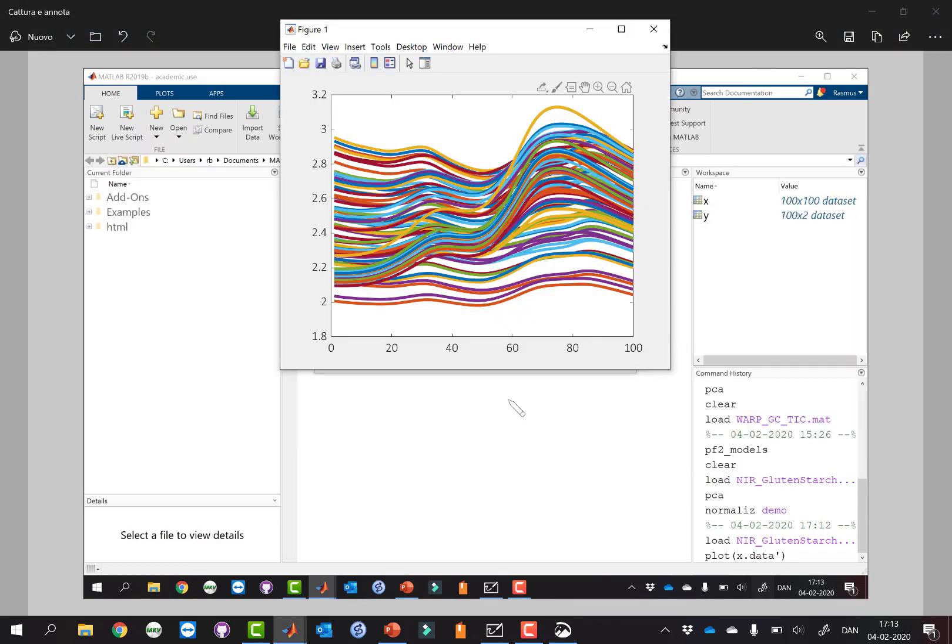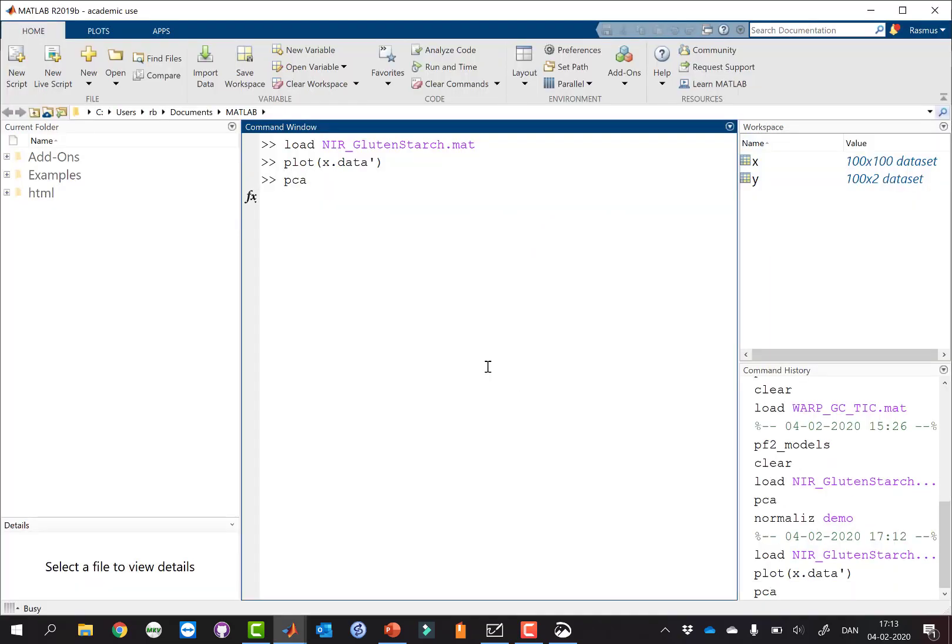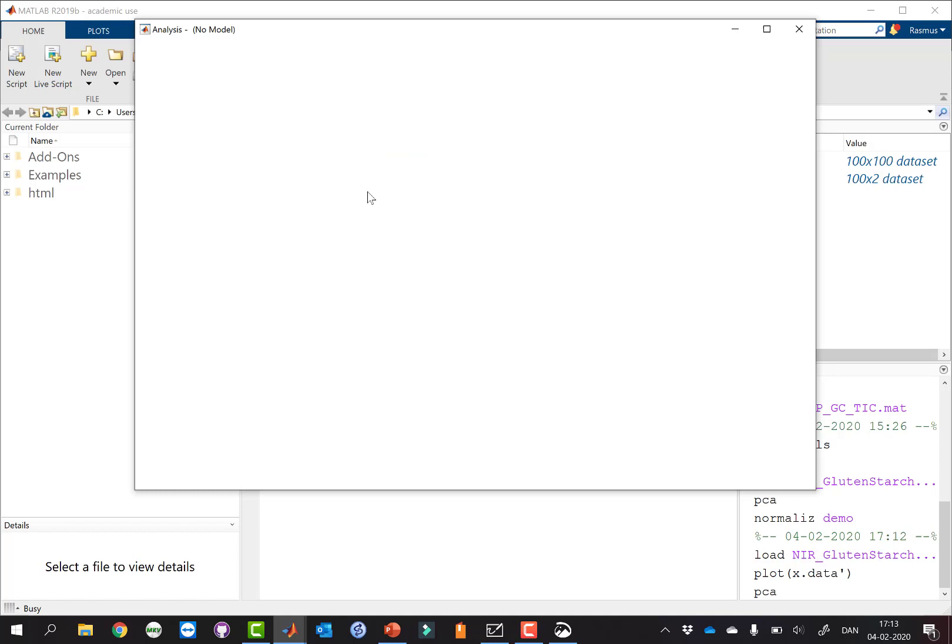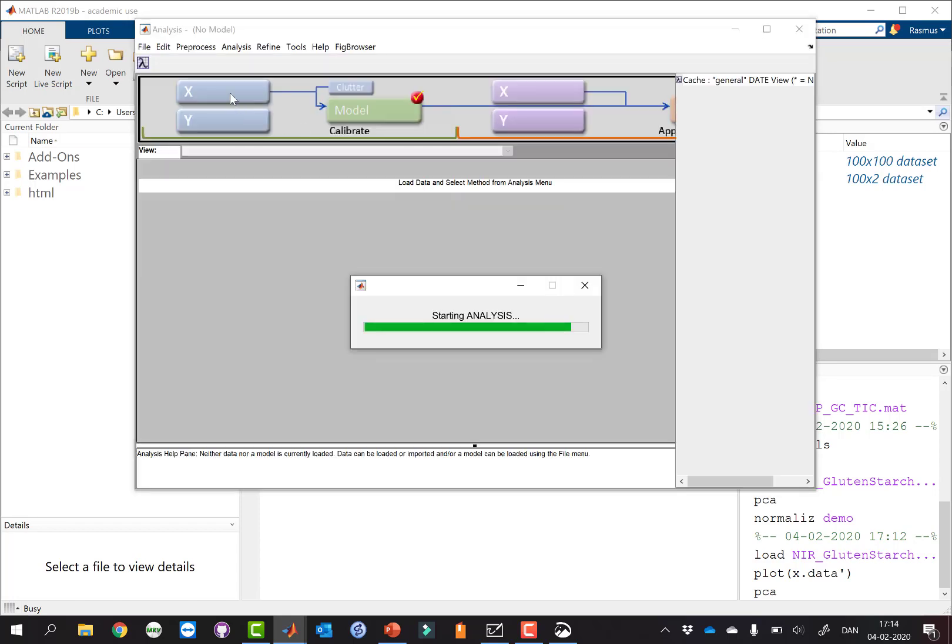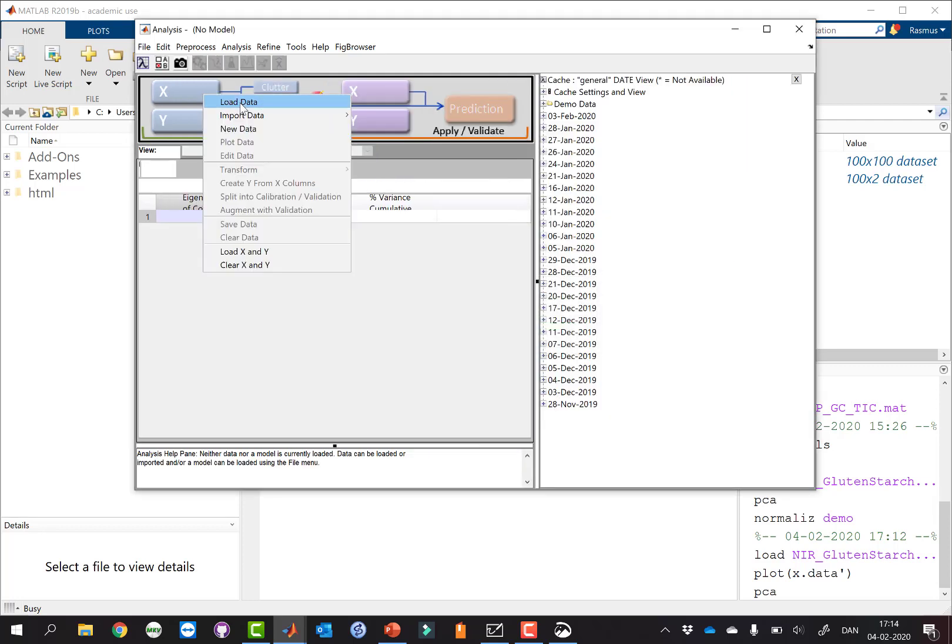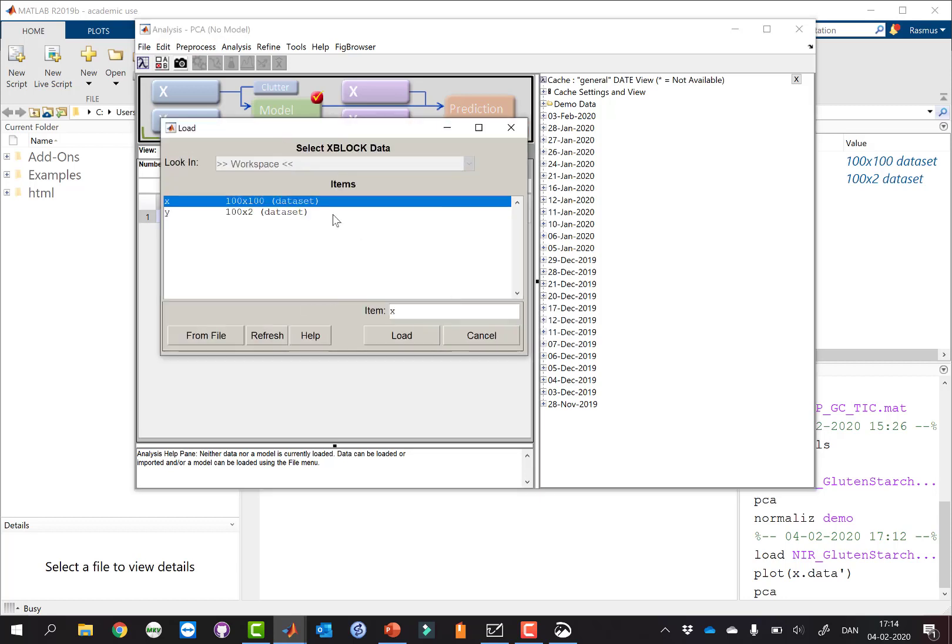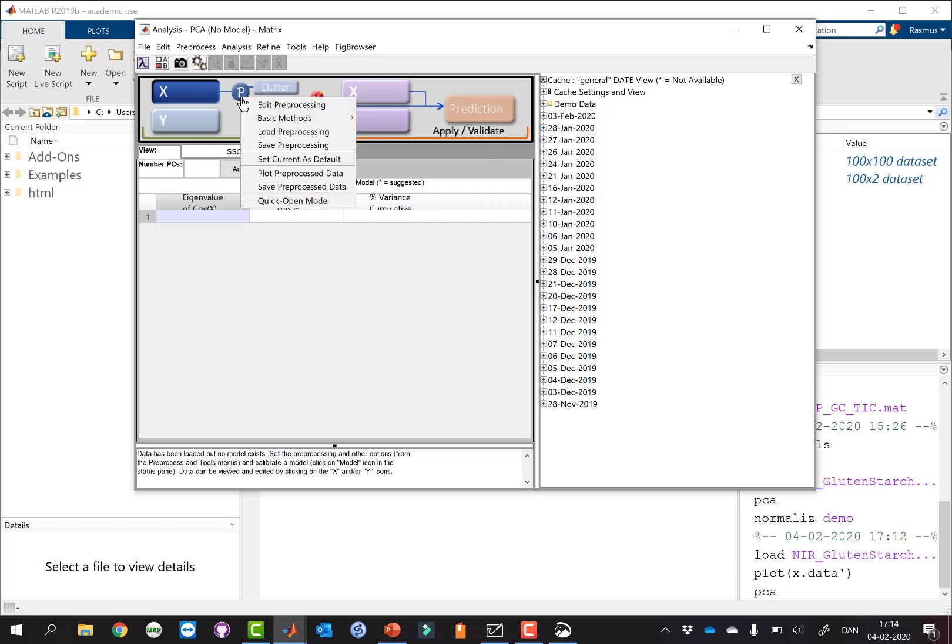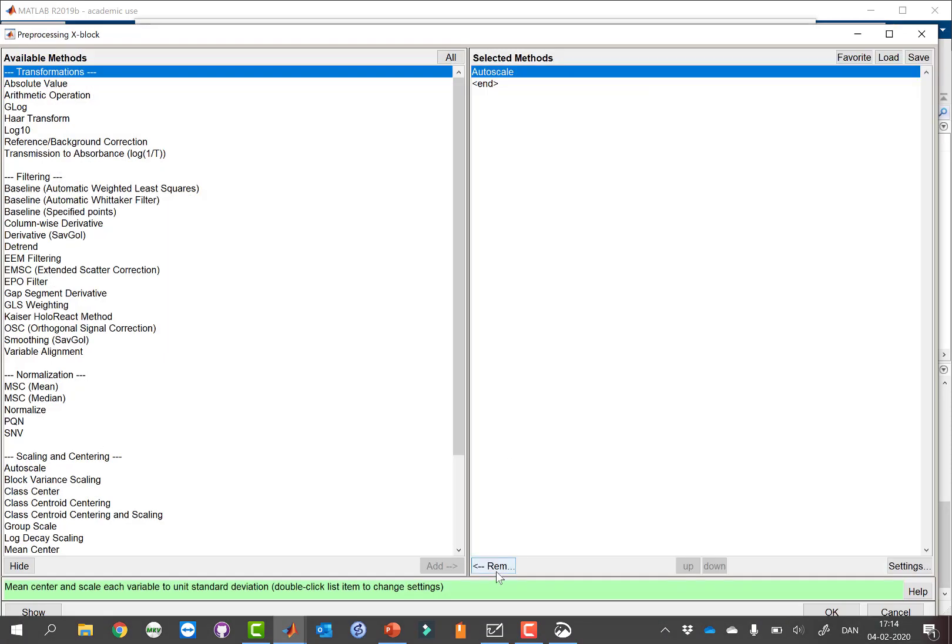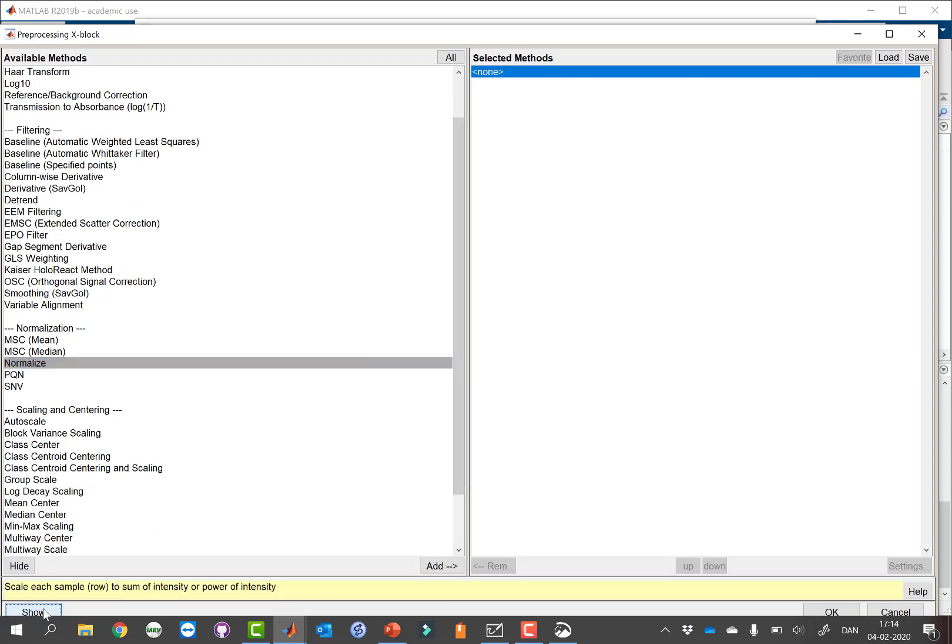Okay, so let's open PCA and let's try and apply different kinds of normalization and see what they will do to the spectra. We're using PLS Toolbox here, but you will find this kind of preprocessing in many software packages. Let's load my spectral data and we're going to go to the advanced preprocessing. If we move down here, here we have normalization.